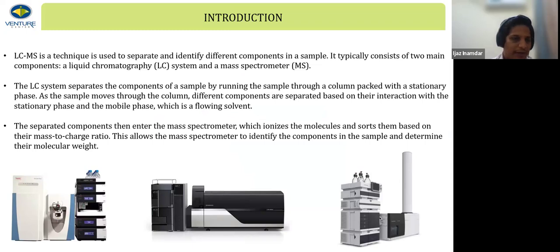As I said, when I talk about mass spec, I'm invariably referring to an LCMS setup, meaning an LC part is connected to the mass spec. That being said, can an LC or a mass spec operate independently? Yes, definitely, and we do operate them independently when there are certain requirements. But connecting them comes with various advantages that you'll appreciate as we dig deeper into the presentation. You'll understand why it is important to connect an HPLC to a mass spec, and what kind of data we generate using an HPLC MS setup.